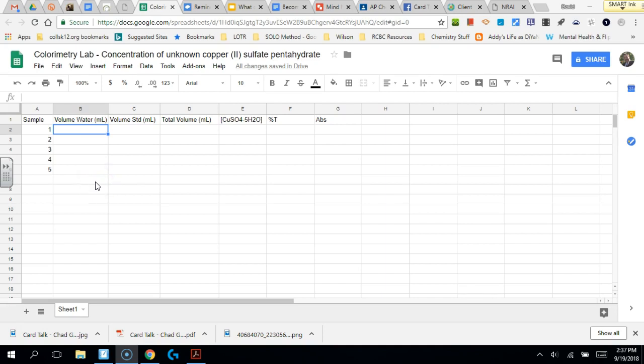Hey everybody! In this video we're going to talk a little bit about the colorimetry lab and how to present the results and how to do some of the calculations, and then we will go from there. So what I have in front of you is a data table. We're going to start here, okay?